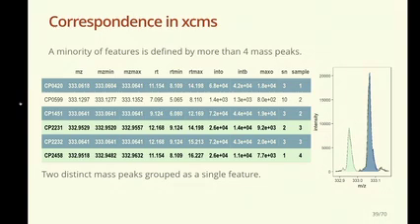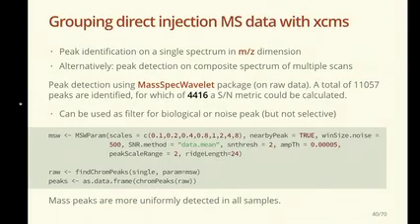We have a lot of mass peaks bunched very closely together in the mass spectra, which renders it very difficult for peak picking algorithms as well. So if a chromatographic method isn't well suited, maybe we can then just treat it as a single spectrum, the spectrum with the highest summed intensity as we discussed before, and then do the peak picking in the MZ dimension. And also there, XCMS has some options for it.